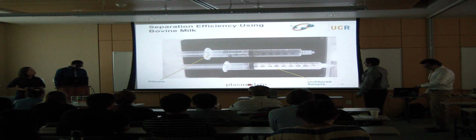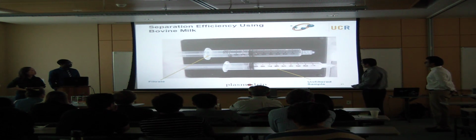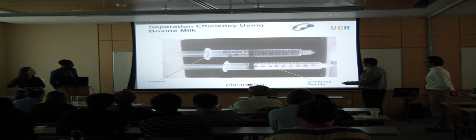This is what we ended up with. As you can see, the difference between our non-filtered sample here at the bottom and our filtered sample after we remove the particles which are 500 kilodaltons and higher.